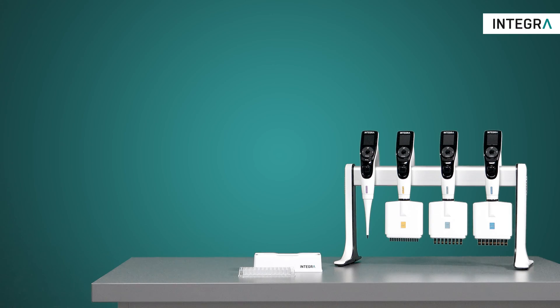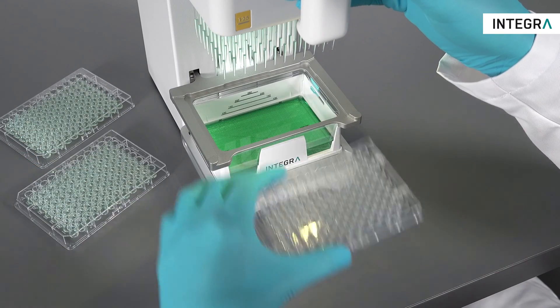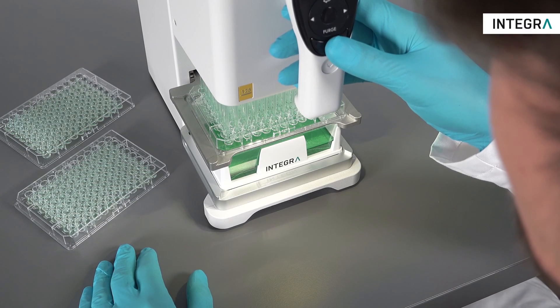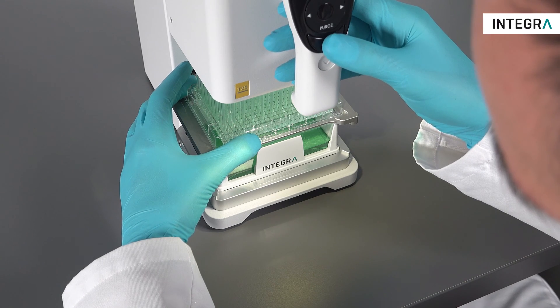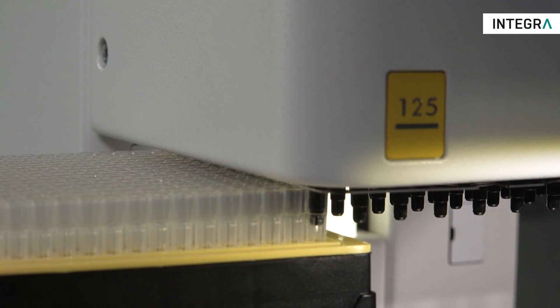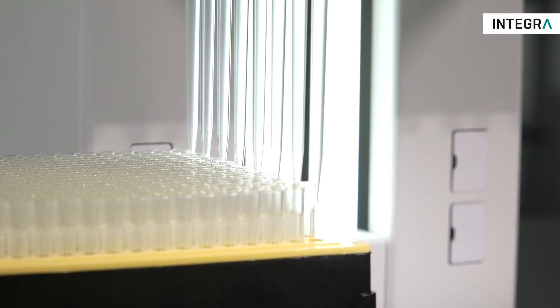With this in mind, Integra introduces the MINI 96, a portable 96 channel electronic pipette. Like any other electronic pipette, it's small and affordable while massively increasing productivity for working with 96 and 384 well plates. The MINI 96 is the solution for all laboratories who want to fill 96 and 384 well plates faster and more precisely than traditional handheld pipettes, and have a very limited budget to work with.